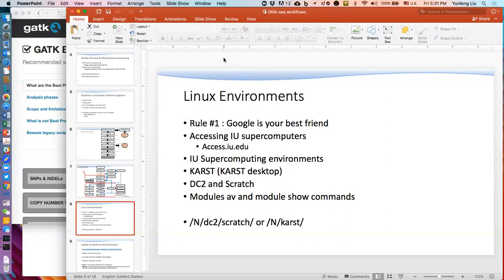Sure, that's absolutely reasonable. But usually that is going to show a little bit in FastQC. If you run FastQC, even before the sequence alignment, it sometimes reports what the overrepresented sequences are. If you have a contamination, which we have seen before, you will see many reads that are identical. Sometimes if they are not aligned, we will have to BLAST them to see where they are. If we see only 5% of the reads are not natural, sure, we still have 95% usable. But if we see only 20% of the reads are matchable, we are going to be very nervous. So we can do whatever tests we need to check that.